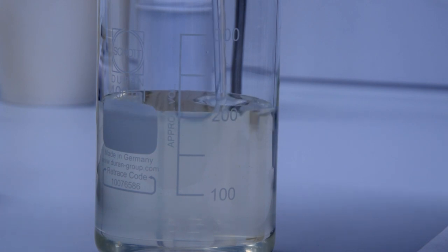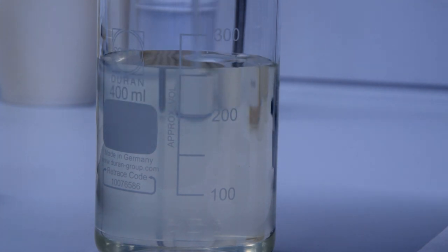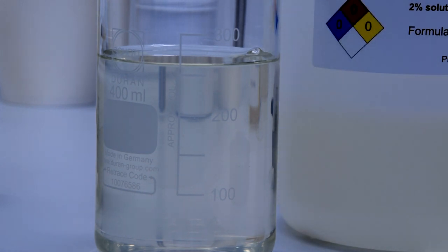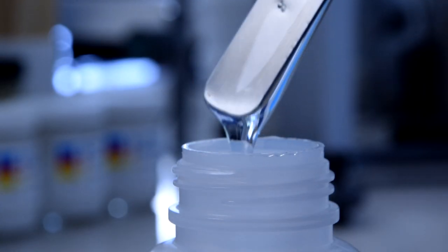Preparation of technical recommendations for thickeners requires laboratory studies for various types of rheological modifiers, starting from cellulose ethers through polyurethane and mineral thickeners to alkali-swellable acrylic thickeners.